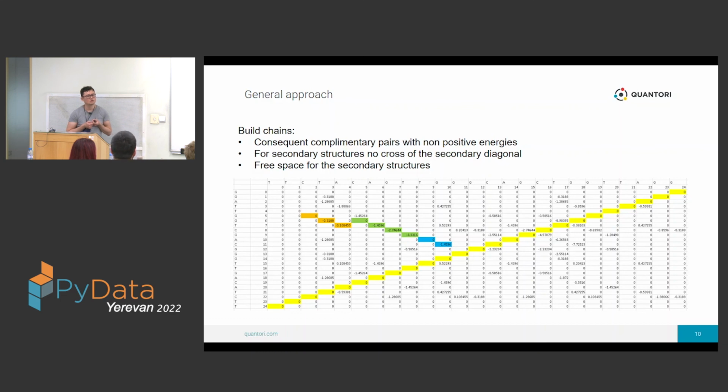So, is there any approach you consider to add in your work? No, I didn't consider that approach yet, but thank you for the idea. Possibly that would be a better approach. I think the classical algorithm is recursive, so we just split that sequence into some subsequences and trace back and find some structure which could be in place for that DNA, right?